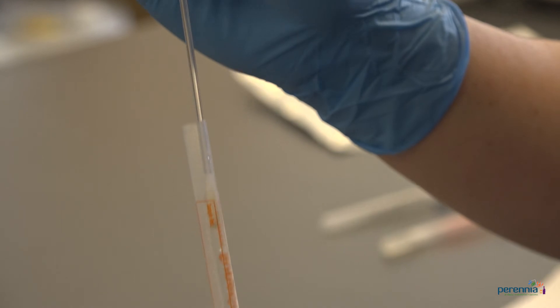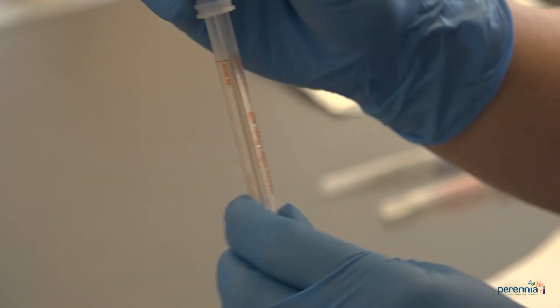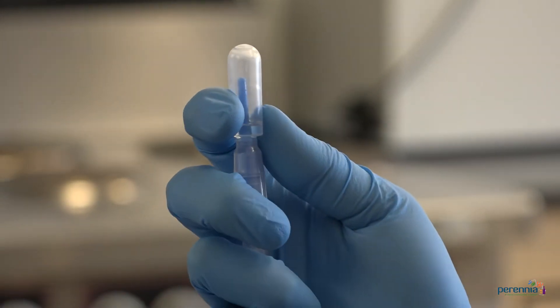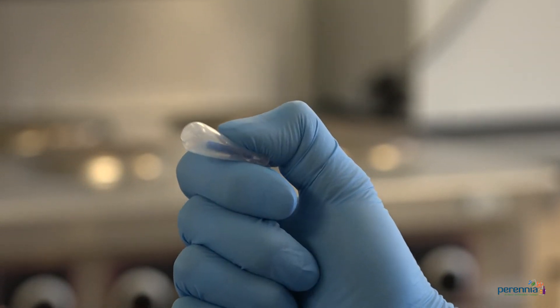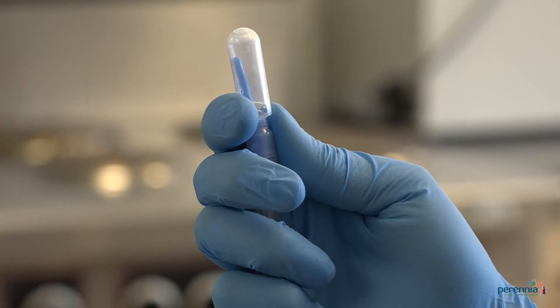Step five, replace swab in tube. Step number six, snap bulb by placing the swab in your fist using your thumb and forefinger to snap the bulb.